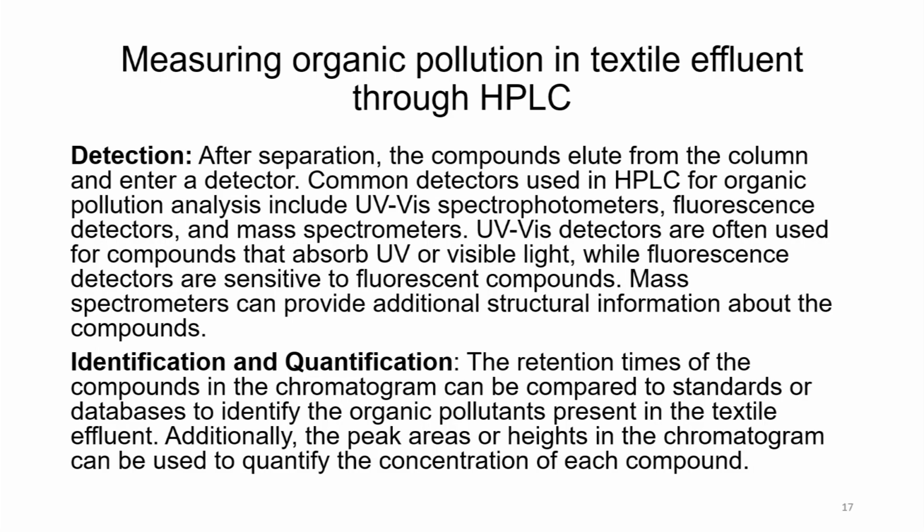Identification and quantification. The retention times of the compounds in the chromatogram can be compared to standards or databases to identify the organic pollutants present in the textile effluent. Additionally, the peak areas or heights in the chromatogram can be used to quantify the concentration of each compound.